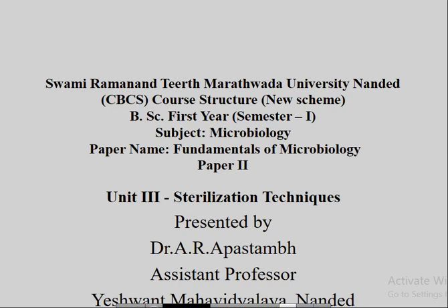Today we will deal with one of the very important concepts in microbiology, sterilization techniques. It is a part of unit 3 in paper 2, that is fundamentals of microbiology. We will see in detail different techniques used for sterilization.